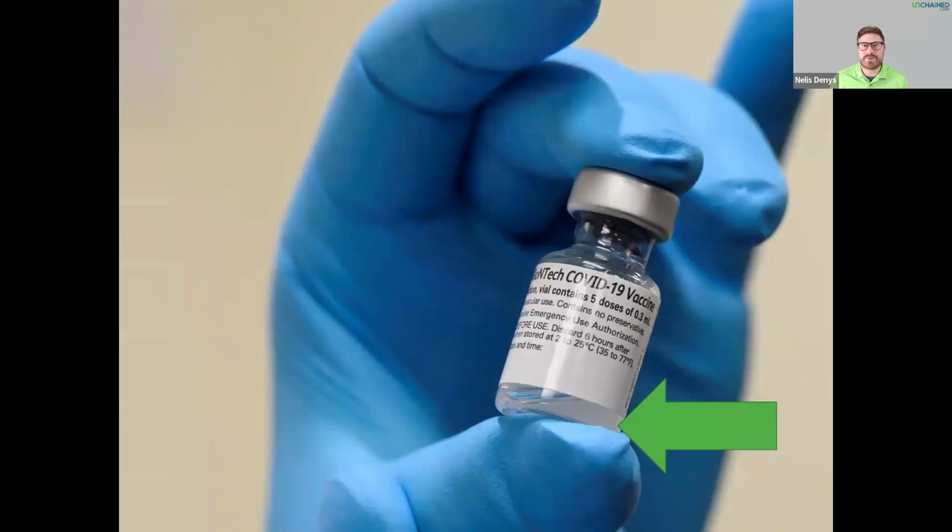But LNPs are typically very turbid, cloudy samples, and so you could try to quantify with UV-Vis, but nanoparticle solutions have so much turbidity in them that they block most of the light, so traditional UV-Vis approaches fail.